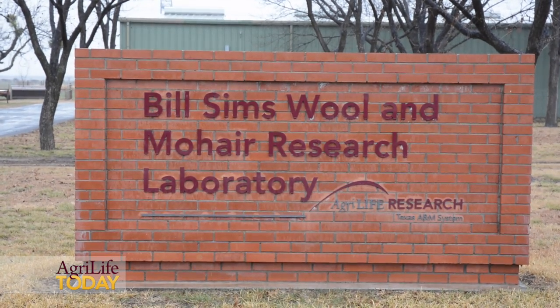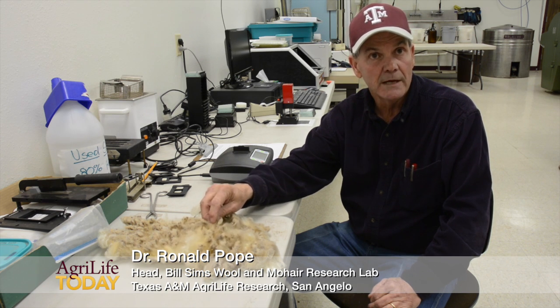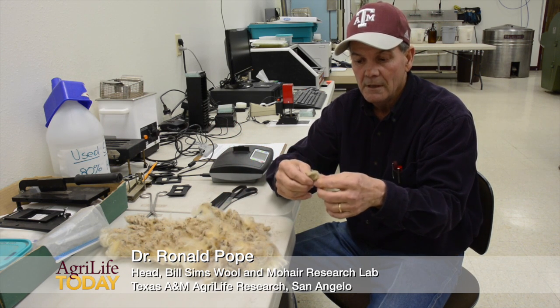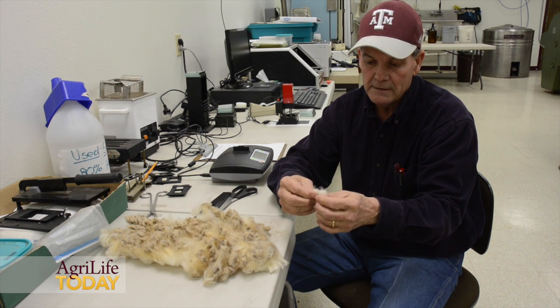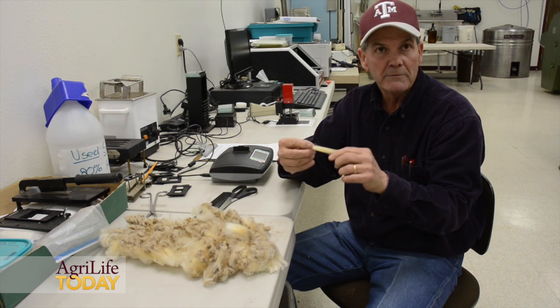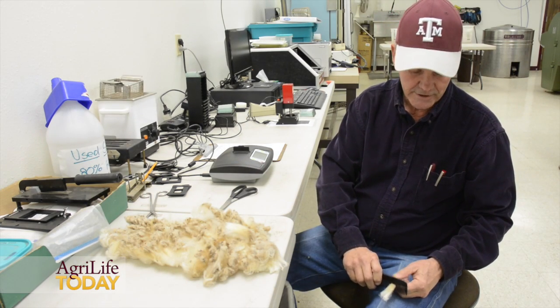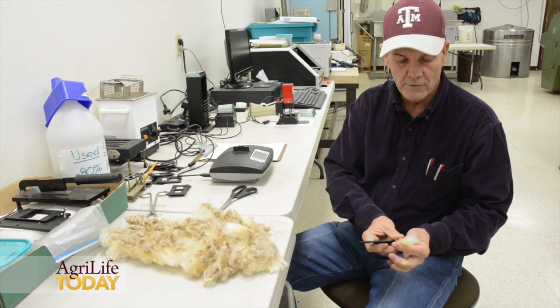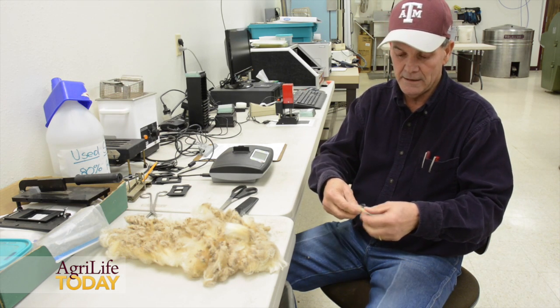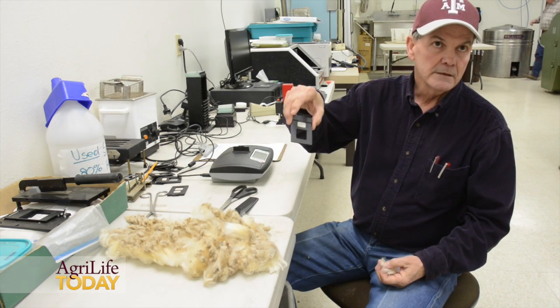In this process of determining average fiber diameter on wool samples, we take a side sample, which is a sample taken from the mid-side of a sheep. From that we'll take a staple of wool, and from that we'll take a smaller substaple — about a pencil size. We run a normal comb through it to assure that the fibers are in alignment and dispersed in a way that we cover the slide itself.